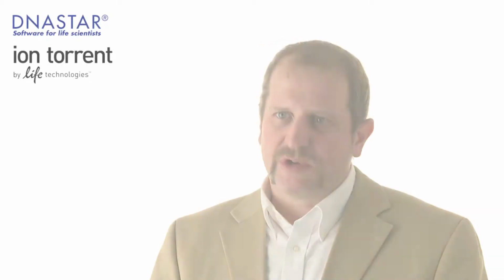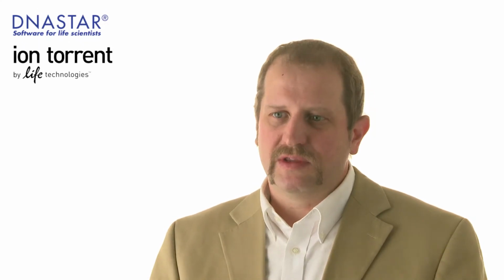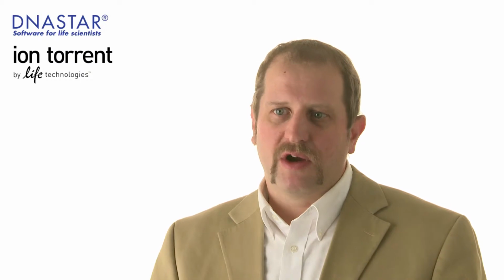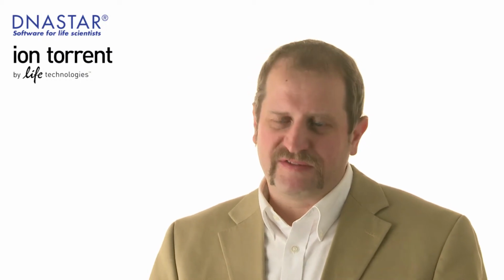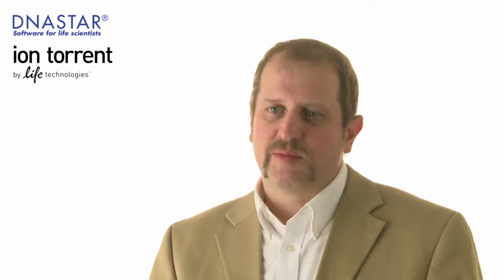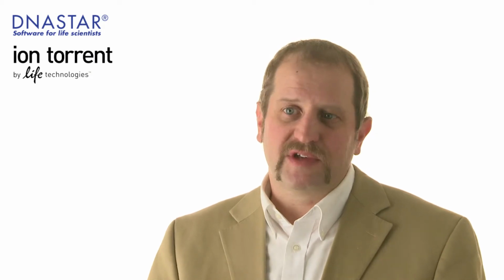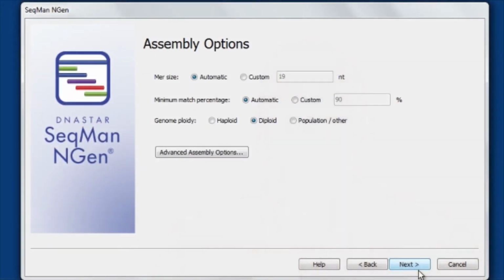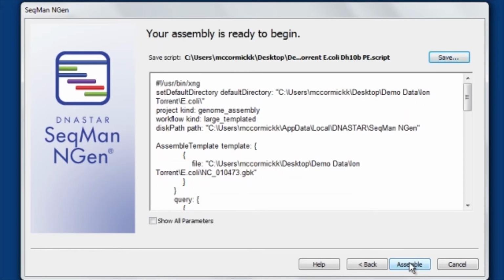When we look into the future, what excites me the most is really the movement towards whole genomes. Now, whole genomes may actually require a couple of different libraries to get the full level of information out of it. We might have a fragment library and a different type of library called a long mate pair library. And these long mate pair libraries help span bridges, gaps that might exist in the sequencing. And it requires a special type of analysis to pull these analyses together.